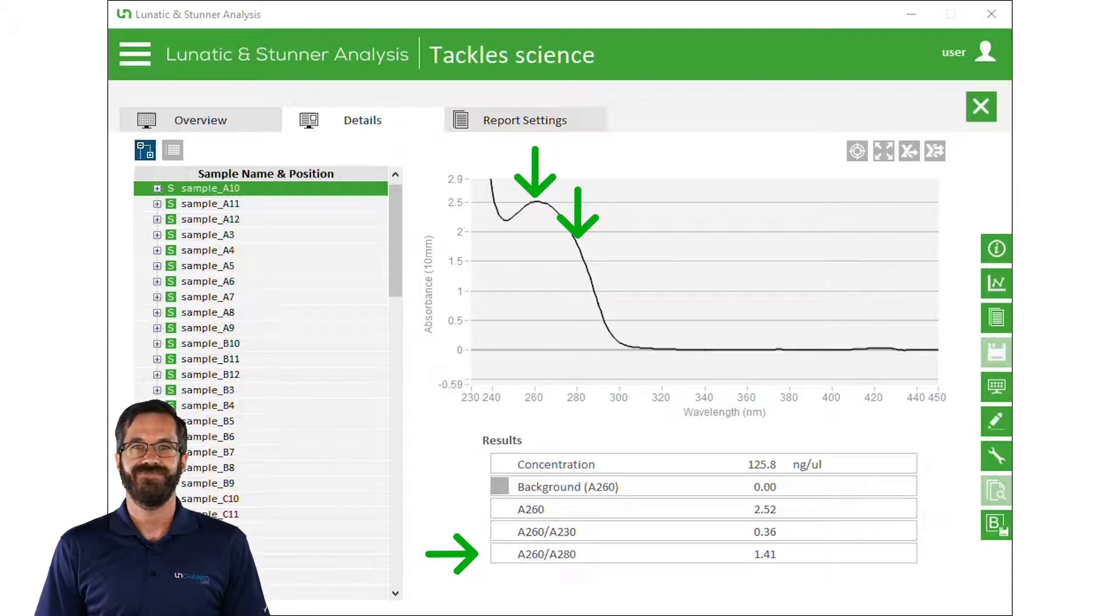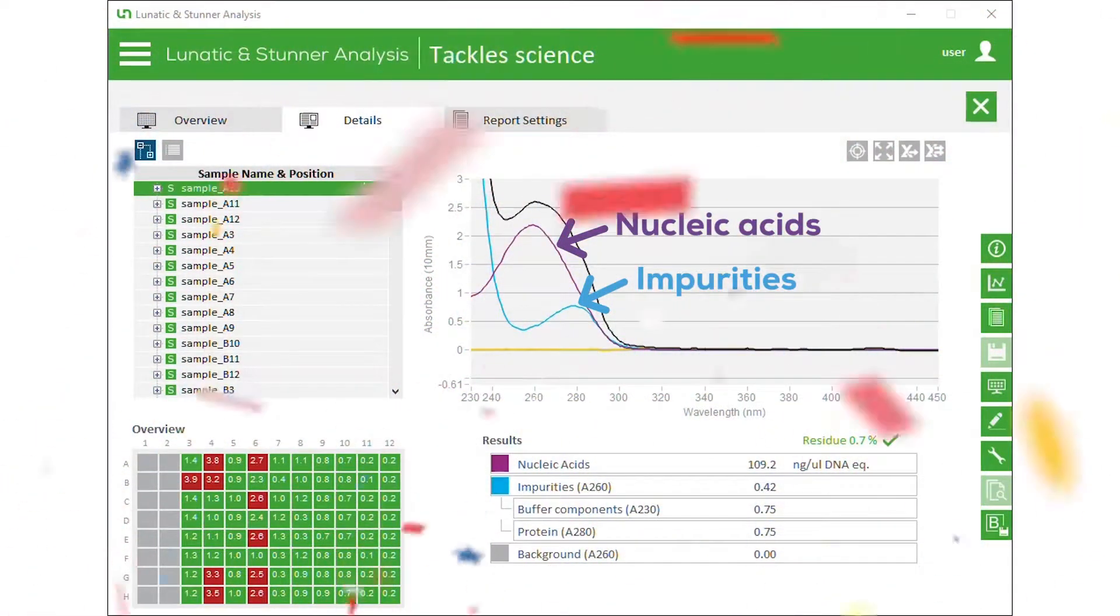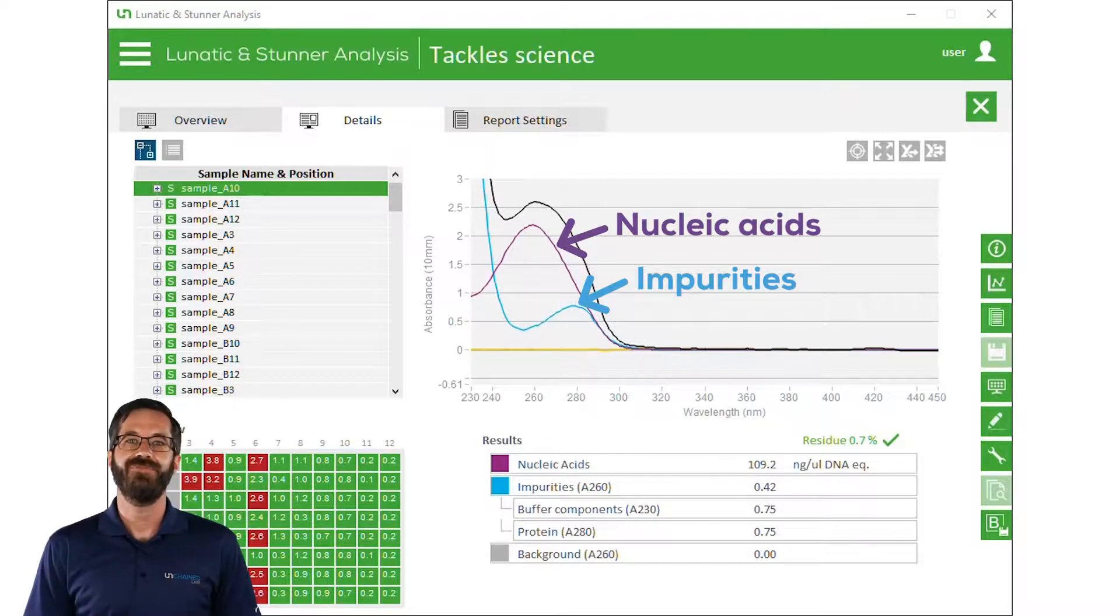But Lunatic has a smarter way. Lunatic comes packed with lots of unmixed applications that let you see the absorbance from impurities that other UV-Vis systems would mistake as DNA or RNA. That helps you understand if that reading is coming from common components like proteins, EDTA, phenol, or more, all depending on the workflow that your sample came from.